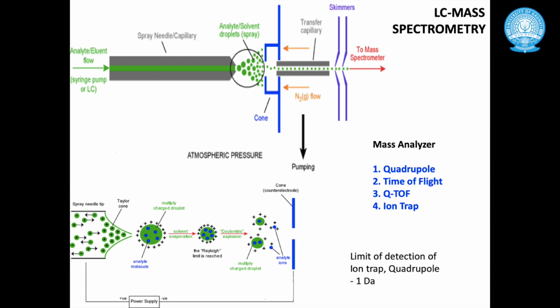This product ion will confirm the structure of the breakdown products of the precursor ion.